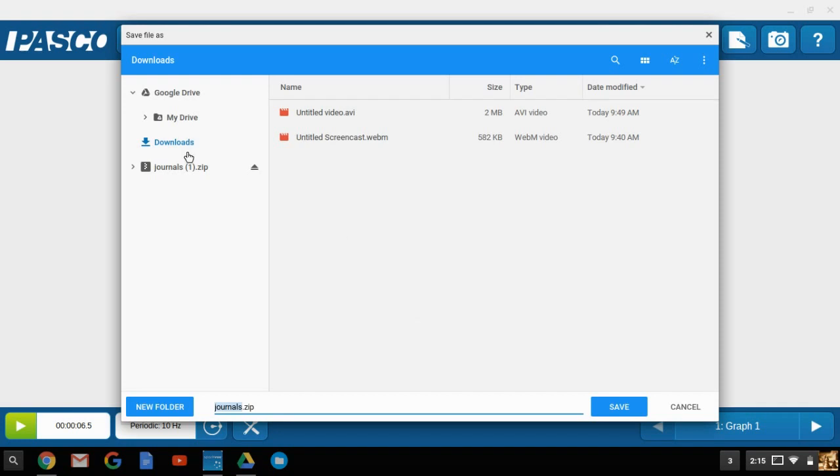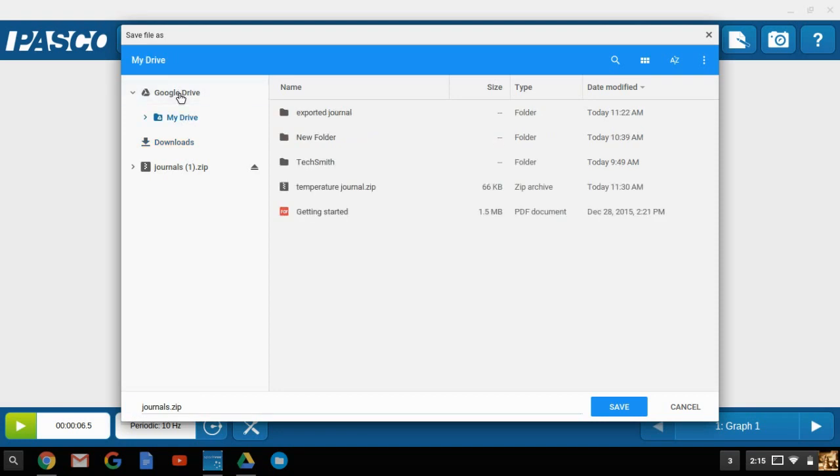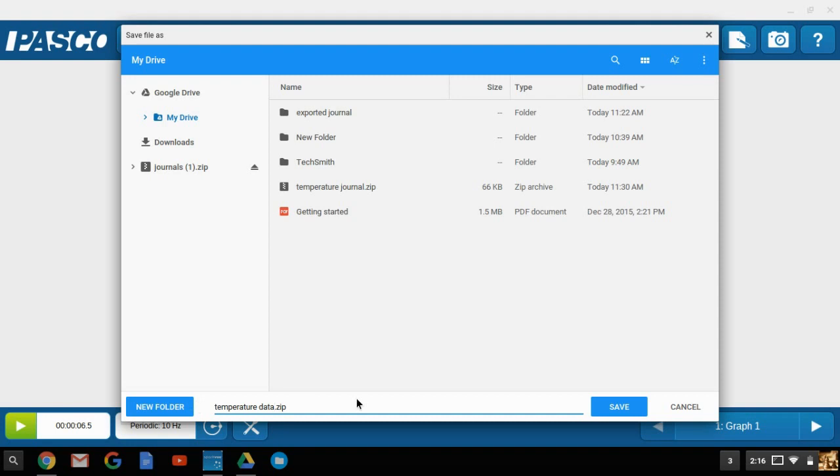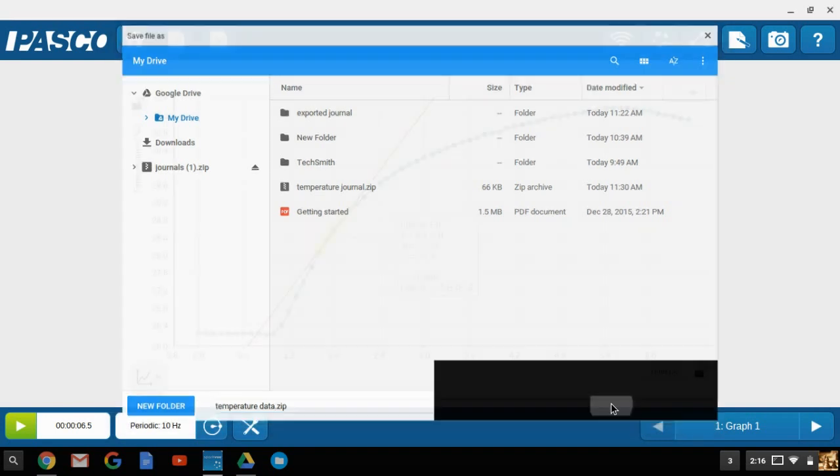I'm now going to select my drive, or my Google Drive here, to export this. So we'll call this temperature data. Please make sure that you only single click on it, as the new folder icon will appear behind it, and often times you can create a new folder without intending to. So we'll call this temperature data. And again, this is in a zip folder file format. So we'll click on save.